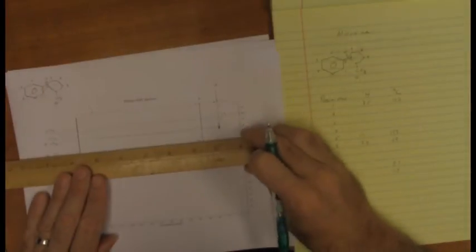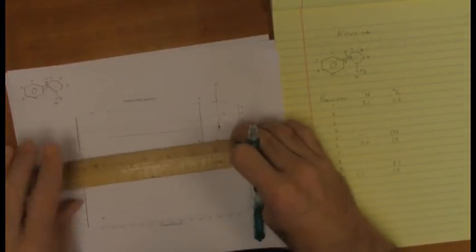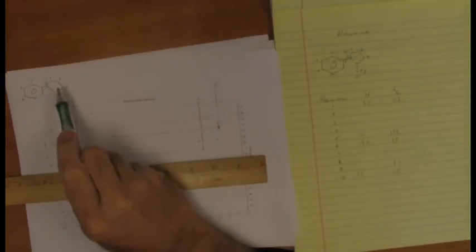And then we have to find the protons that are attached to it. And once again, our dear friend, the HSQC, is going to play a role here. I'll put in my position 9 mark here. And then we start doing the magic. I want you to note very carefully as you look at this. You'll notice as I come across it, I'll mark it with a ruler, then pull it away for just a moment. There is not one, but there are 2 cross peaks for the carbon at position 9. There are 2 protons attached, and they do not have the same chemical shift.